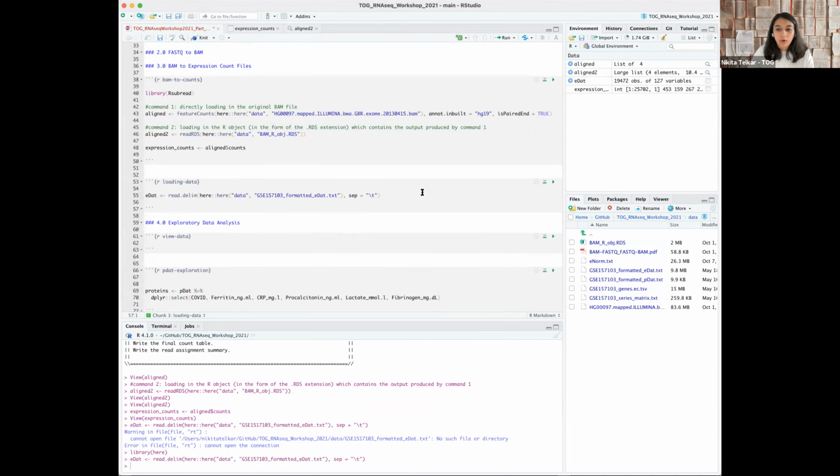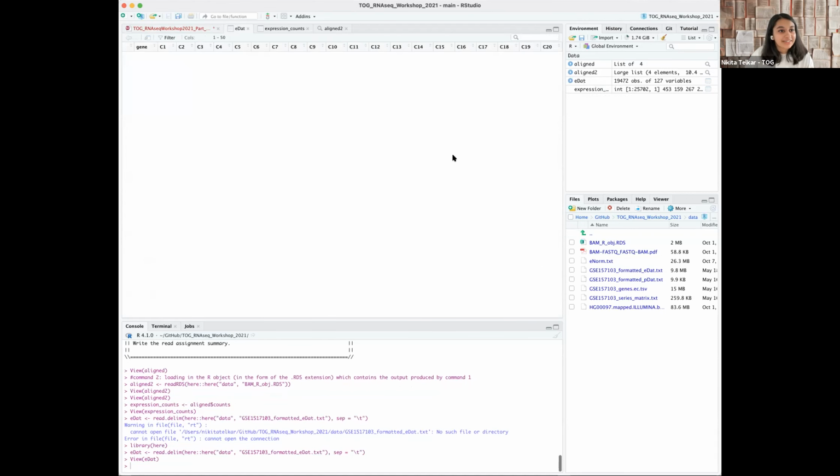So this happens all the time. Even if you have a full workflow, you're going to go through these things where sometimes you've missed something. You miss a comma here or there, and it's not going to work. Okay, so we have our expression file.